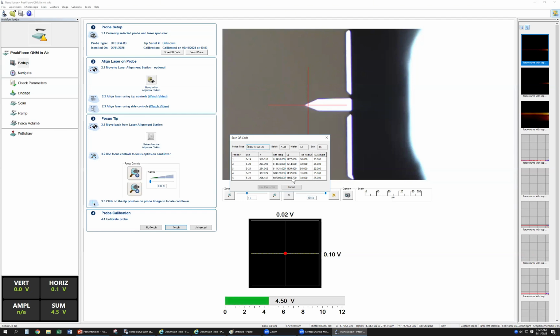Do you have any questions about the relative method? If we use this ordinary one, once we get this parameter, we can use it for the next time, right? Yes. So we spend time and then we save the money.